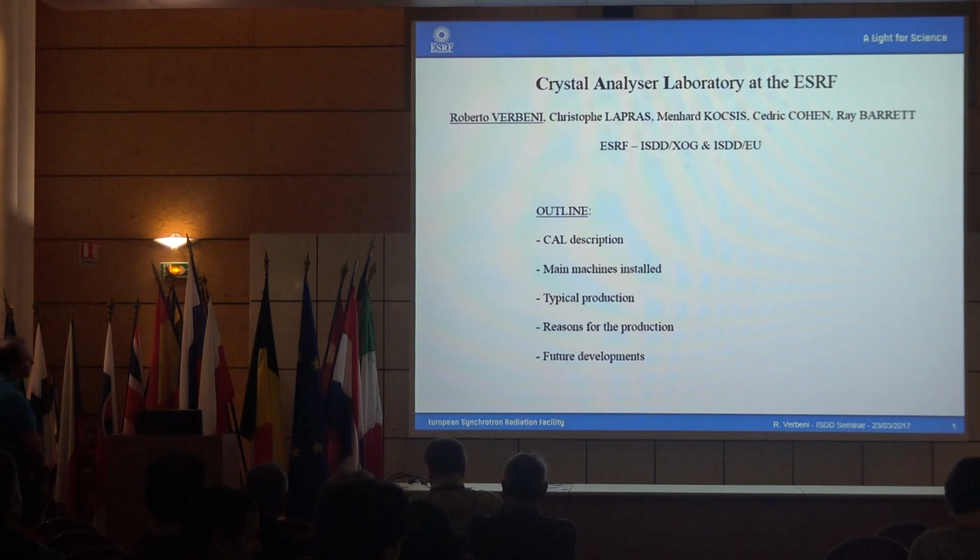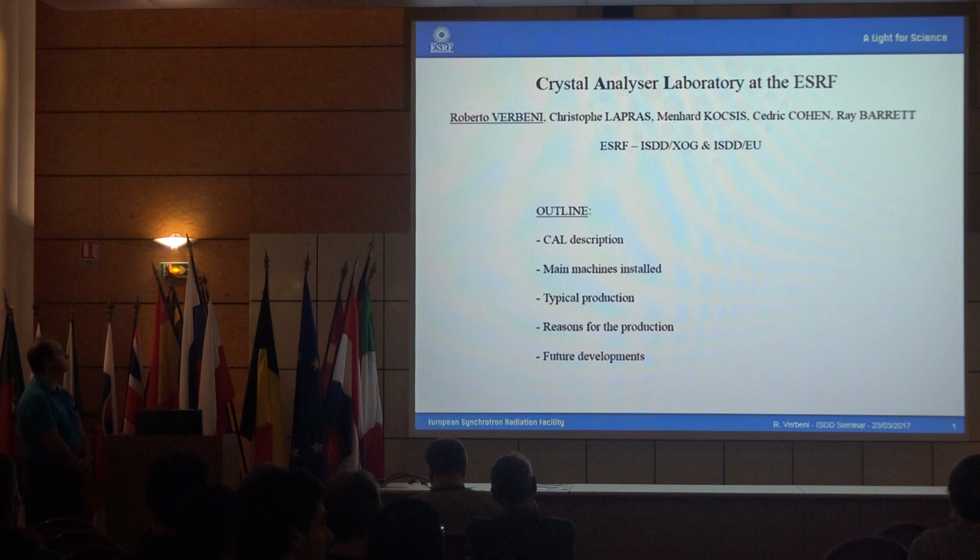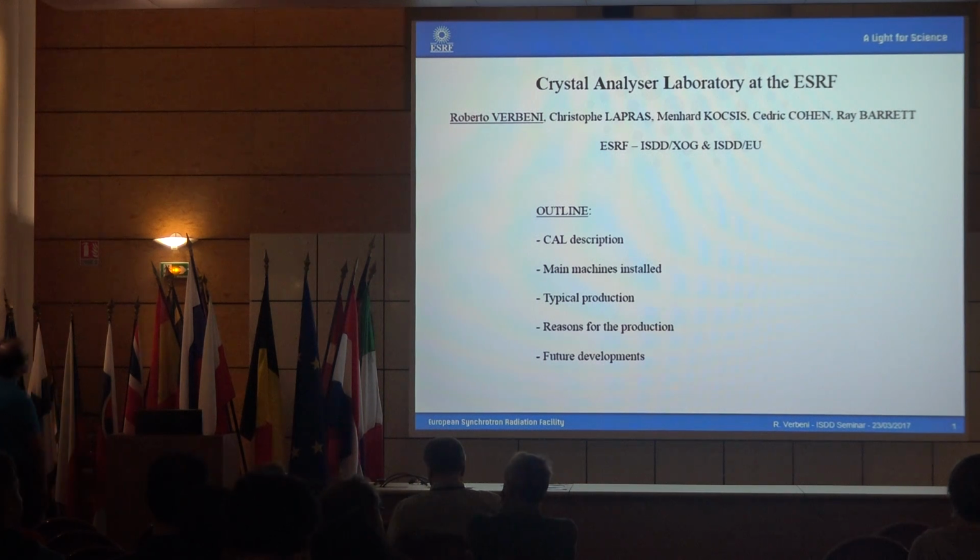So we will see a series of spherically bent, but also cylindrically bent crystal analyzers. He told me that he has been working on such a subject for 20 years, so expertise is not what is lacking.